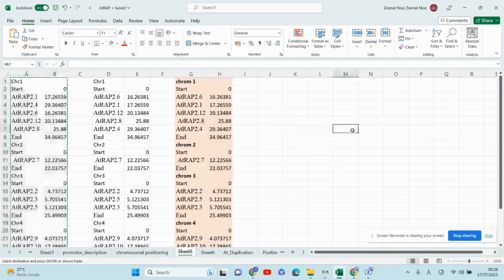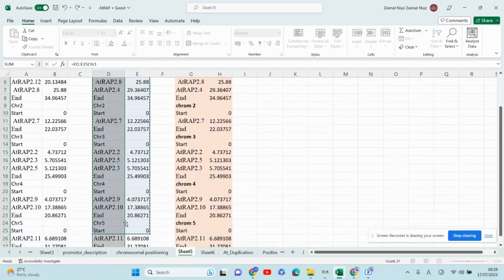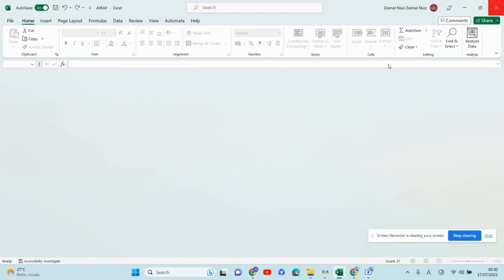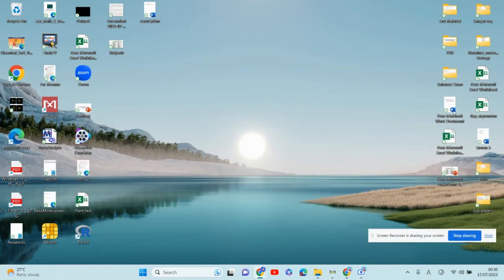And the other thing is that when I copy this data set, I'm sorry. Let me open the file again.